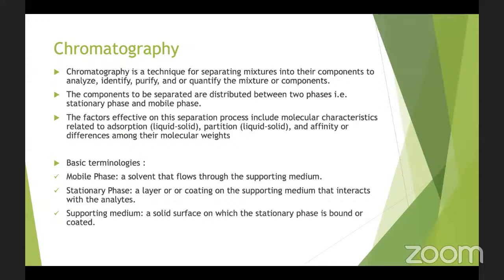Mobile, because it moves, and the stationary phase is the phase which is stationary and which causes the separation. Suppose you have a sample made of different components, and you want to isolate or extract these components separately from it, then you will use chromatography.